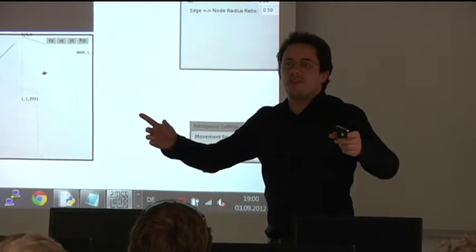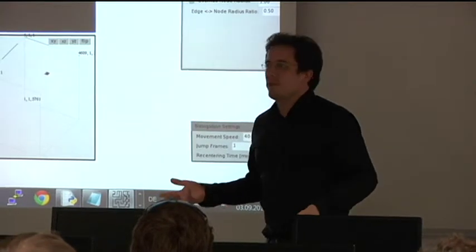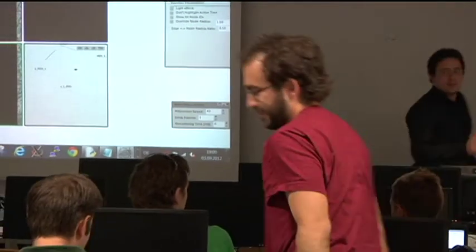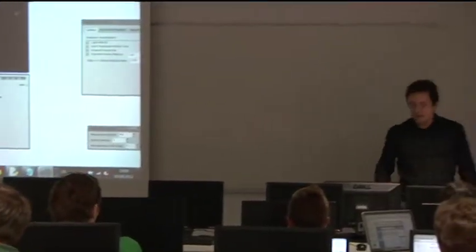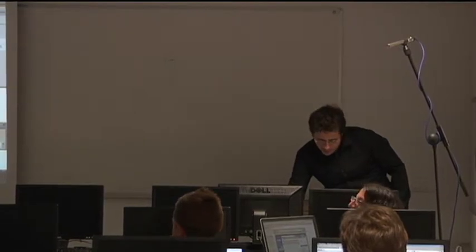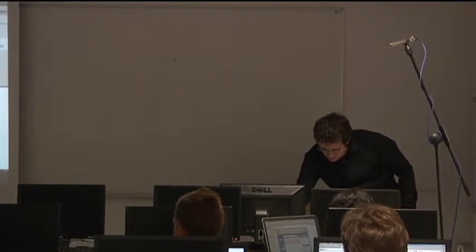Okay, so just a competitor, I think we need at least one comparison run. Who thinks you're better? Okay, good. And I'll give you something that I didn't give you, which is unfair. I'll show you the speed up button, if you think it's too slow, and then we can see whether that helps. We should compete on the same speed though. Okay. It's really serious. Okay, good. Then we'll do that. But if you're desperate, you can just go on, plus, and then it's twice the speed.